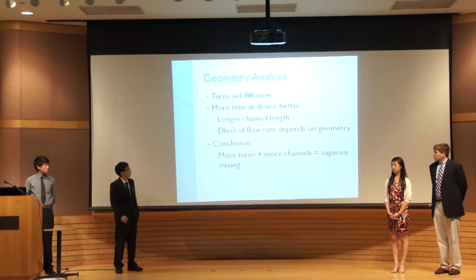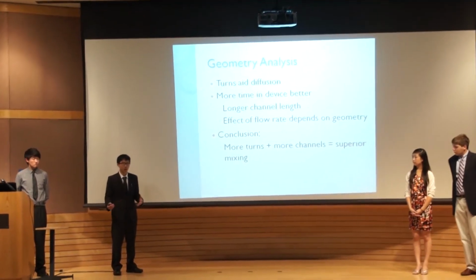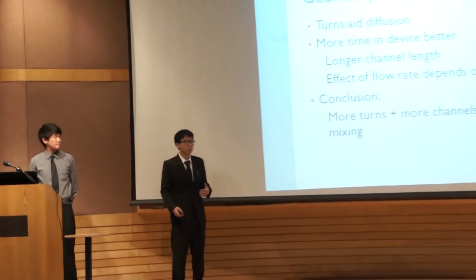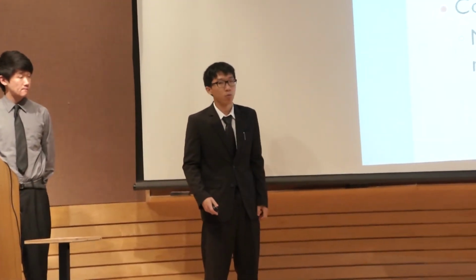index value. We also found that the effect of flow rate really depends on geometry, like how many turns you have and how long your channels are. So in conclusion, if you were to propose a better device or a better design, you would encourage more turns and more channels.